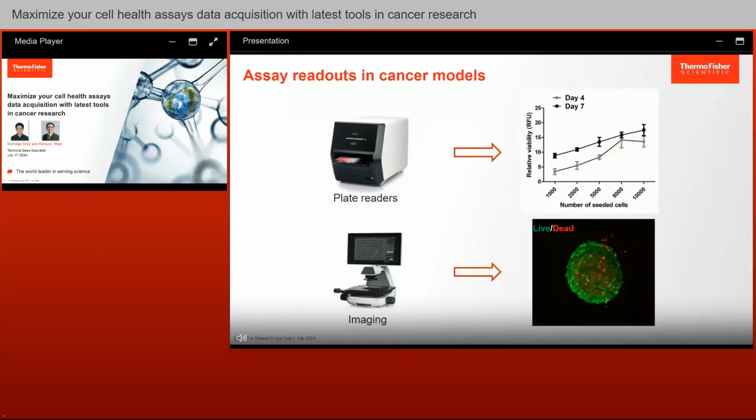Okay, thank you, Nicholas, for sharing in the first part of the webinar. So as Nicholas has already mentioned, cell health assays can be read in various methods for categorization and analysis. And I'll be touching on the second part where imaging allows us to view and understand the functional and morphological changes to your cells.